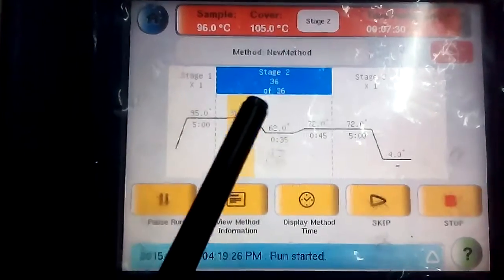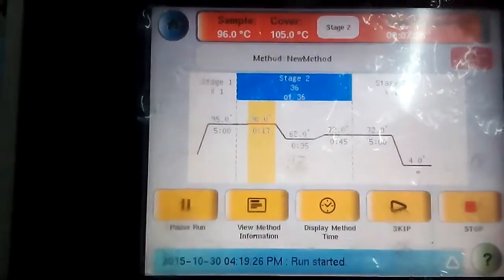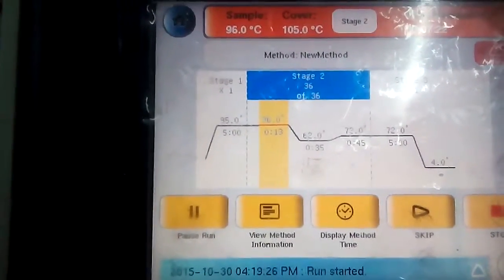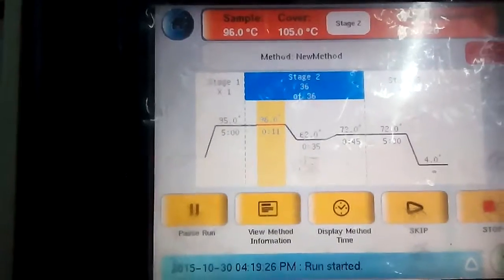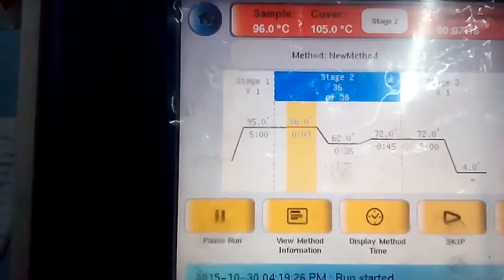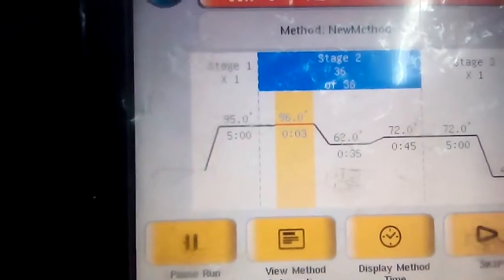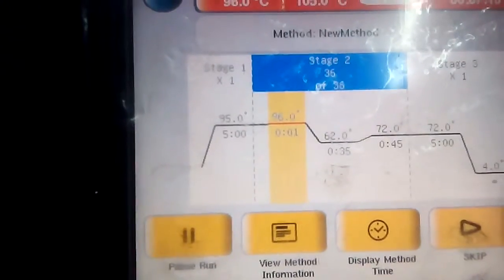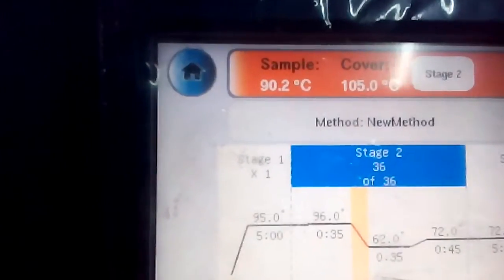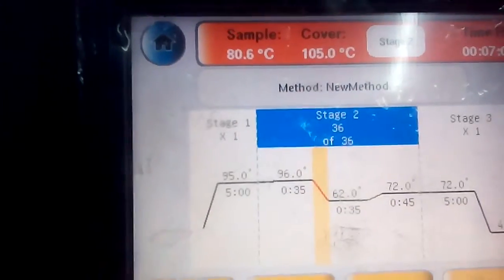Stage 2 consists of 3 phases. The first is the denaturation of double stranded DNA to form single stranded DNA, where the temperature is maintained at 96 degrees Celsius for 35 seconds. As you can see, there is now a shift in temperature from 96 to 62 degrees Celsius.